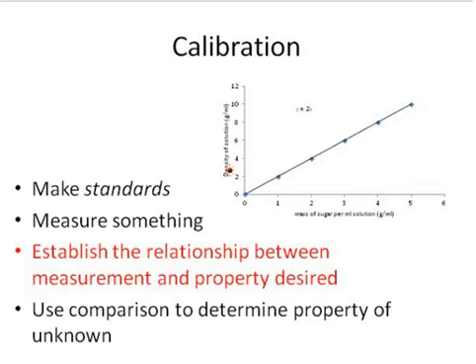Keep in mind you have to do that for every graph you make in this class. And then we've placed the points on the graph. And so the points are basically an x and y pair. So the x in this case was the known value. The mass of sugar was 1 gram per milliliter solution, and the measured density is 2 grams per milliliter, or something like that. We're just using example data in this case.